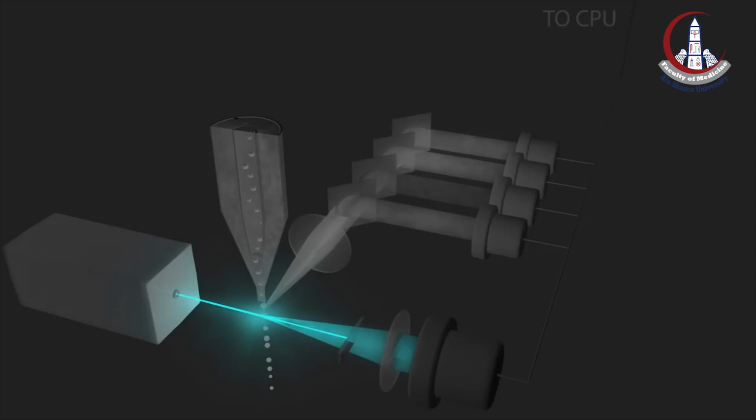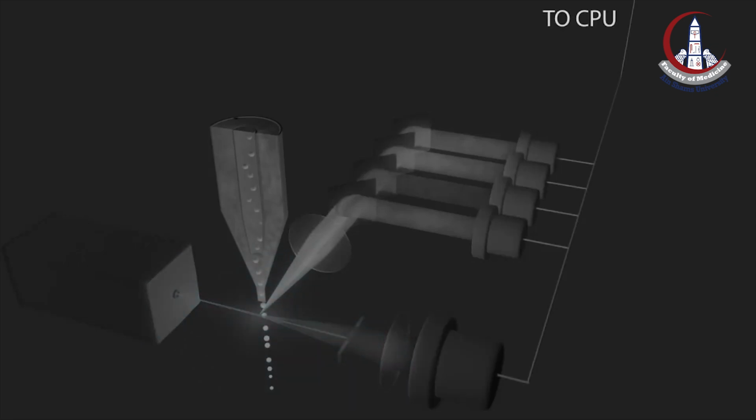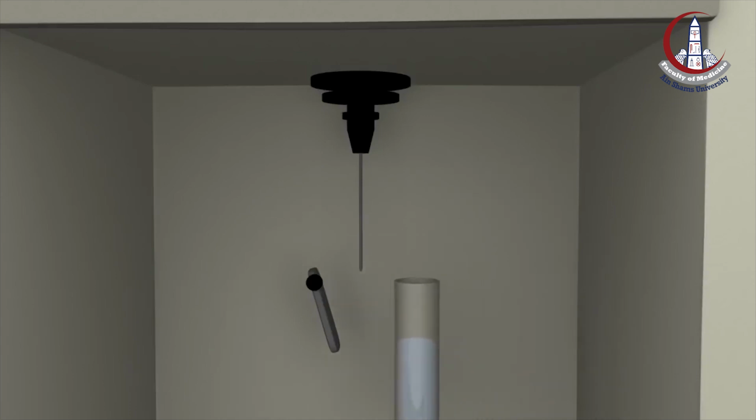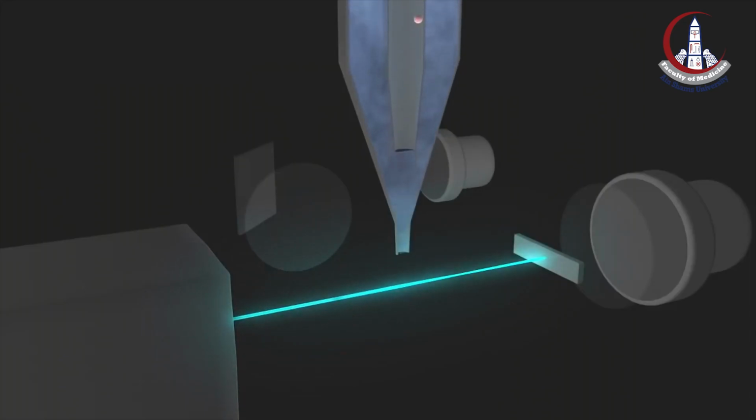It contains several key components, including the sample, fluidics that move the sample into the flow cytometer, lasers, optics which gather the light, detectors to sense the light, and a computer system to output the data in a form that can be analyzed by the flow cytometer.